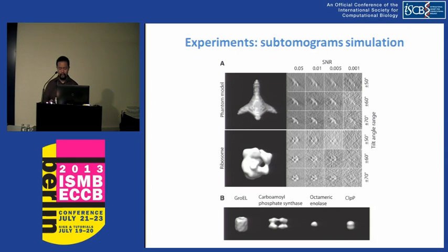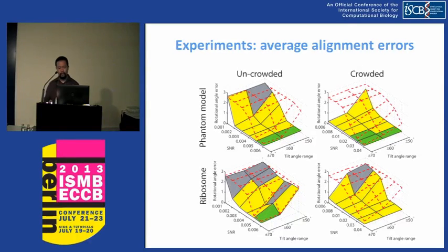Overall, our target complex segmentation procedure achieved more than 90% true positive rate and less than 0.4% false positive rate in region detection, and the estimation of the center of mass in general has an error of less than 2 voxels. And then we perform pairwise alignment of subtomograms.